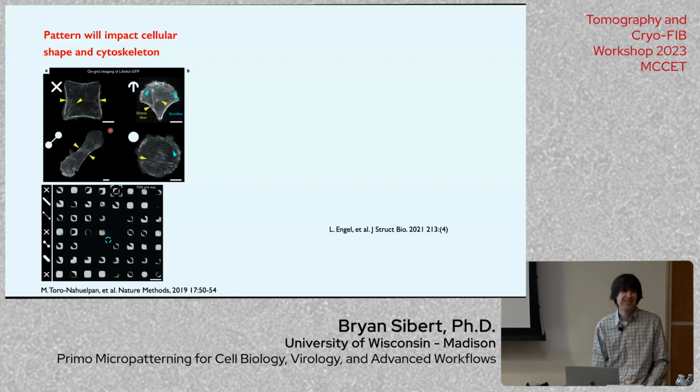Okay. And the second question is, as we all know, the grid is pretty fragile. Let's say I have prepared 8 grids, how many grids will survive the whole micropatterning process? I'd say all of them generally. Maybe when you're first starting out, I'd prepare a few extra, but now if I make 8 grids, they'll all make it through to the end. It's just a few extra handling steps. Once you're comfortable handling grids, it's pretty straightforward.